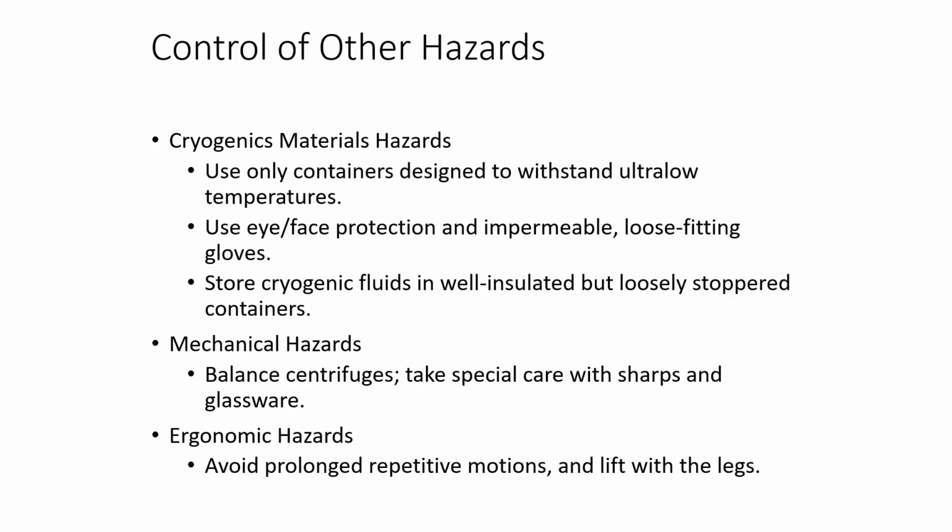Cryogenic materials. Use only containers designed to withstand ultra-low temperatures. Use eye and face protection and impermeable, loose-fitting gloves. Store cryogenic fluids in well-insulated but loosely stoppered containers.